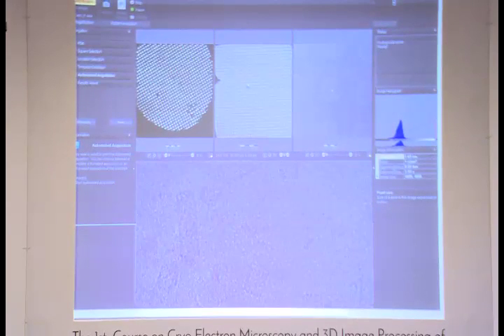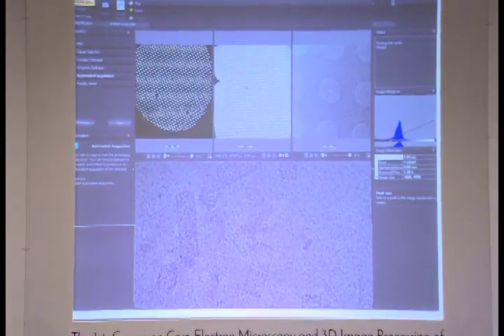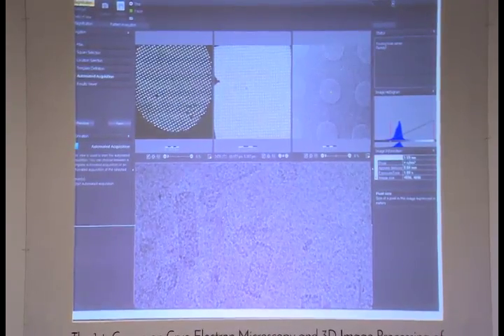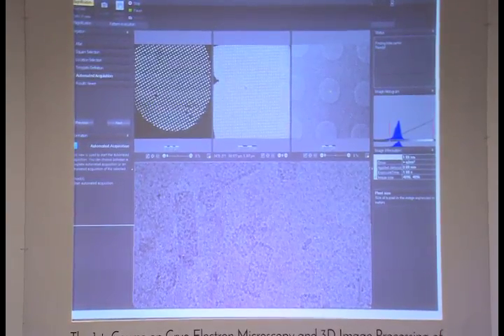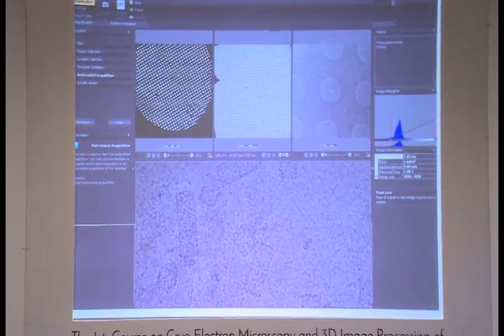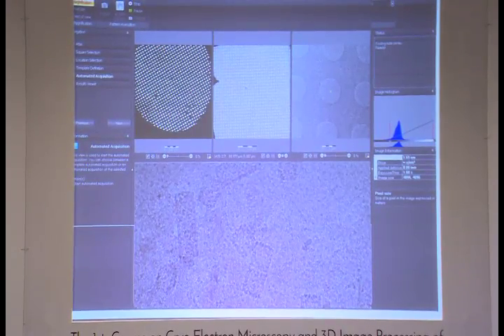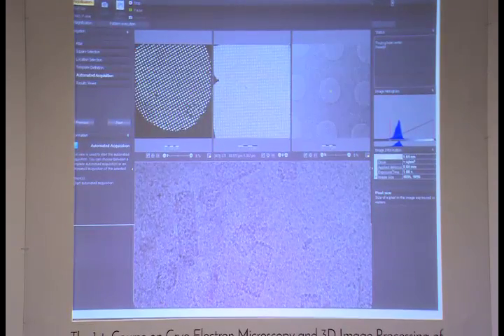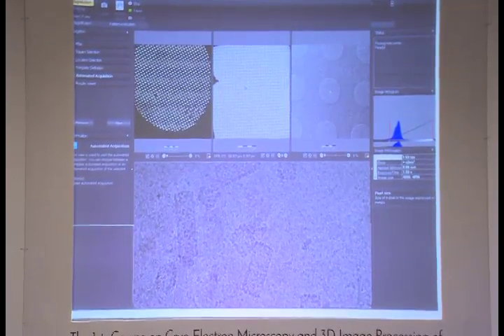Well, it depends, of course, on the defocus that you set, what your contrast level will be, and generally you would have to set it based on your CTF function and what you would want to cover in your spatial frequency range. But generally, the image here will look sharper, essentially because it's smaller, so you get a coarsening just from that.